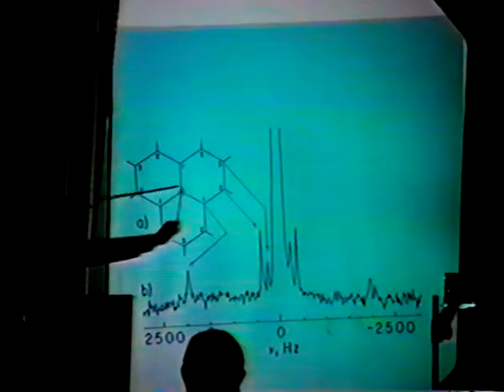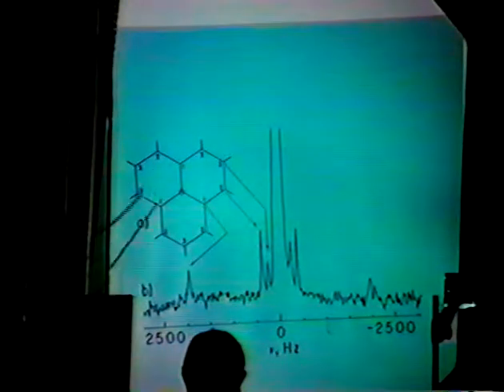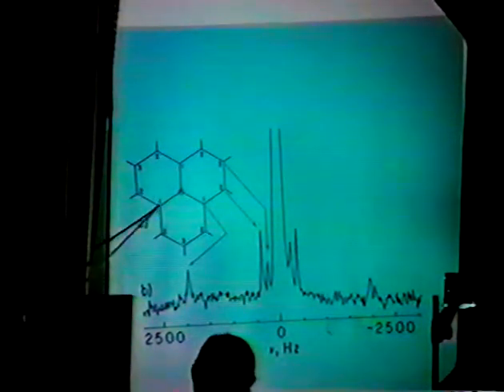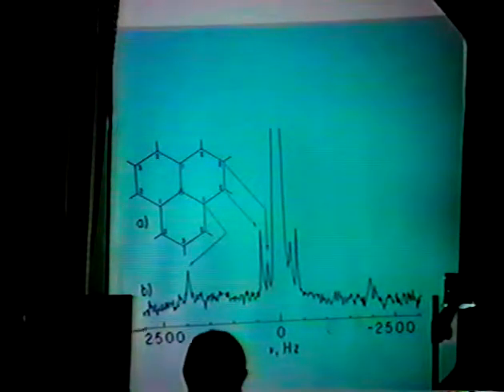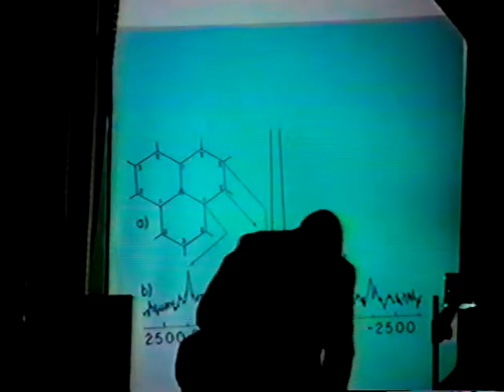This spectrum was taken with the magnetic field normal to the plane of graphite, so that all of these will have exactly the same splitting. We have chosen other angles that are measured in standard. But this allows us, because we know the way this field varies as a function of distance, to actually measure the size of the graphite crystal. So that's one of the things we can do with graphite intercalation.